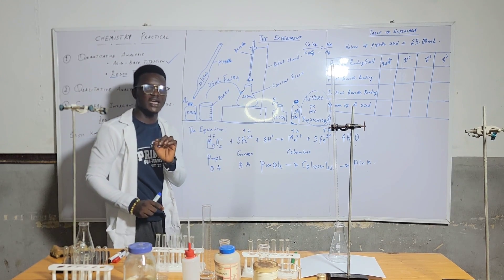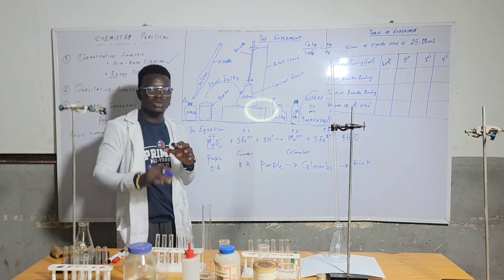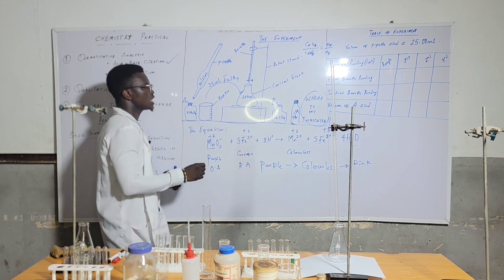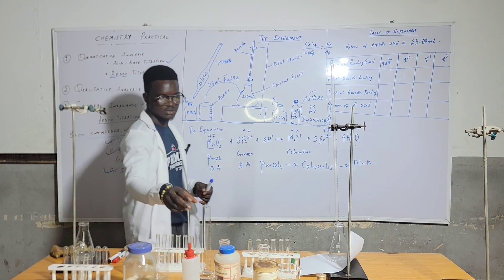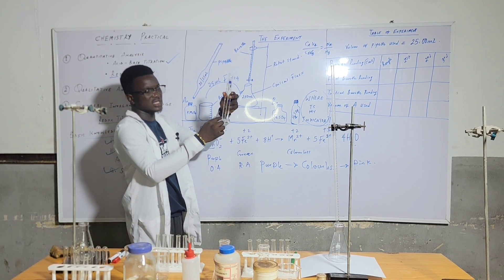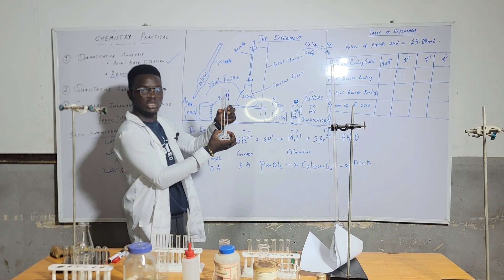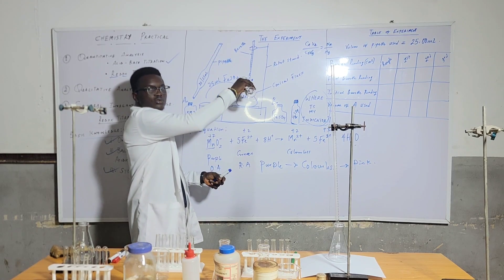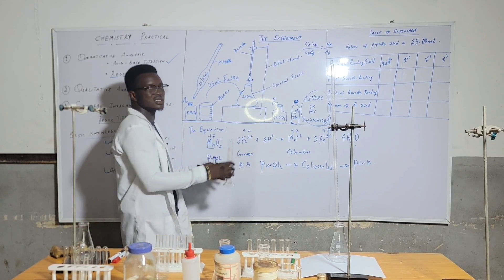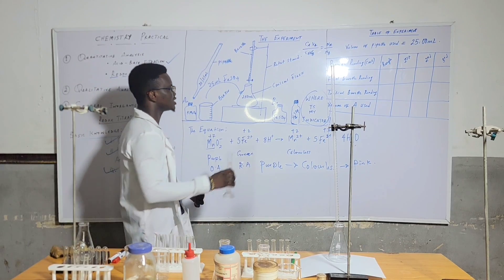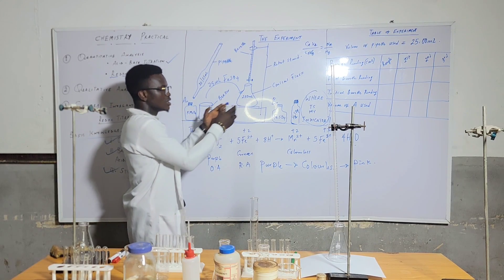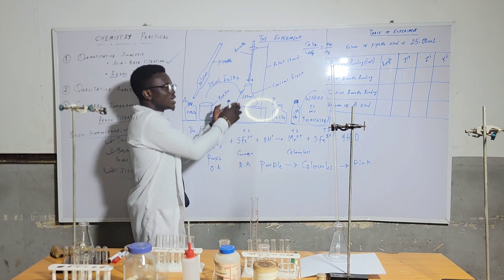Now, we have pipetted 25 mL into the conical flask. This reaction must be acidified — the major reason for adding acid is to keep the concentration constant, to stabilize the concentration of FeSO4. After transferring FeSO4 from the beaker to the conical flask, you use a measuring cylinder to measure — for example 20 mL — of H2SO4 and pour it into the conical flask.